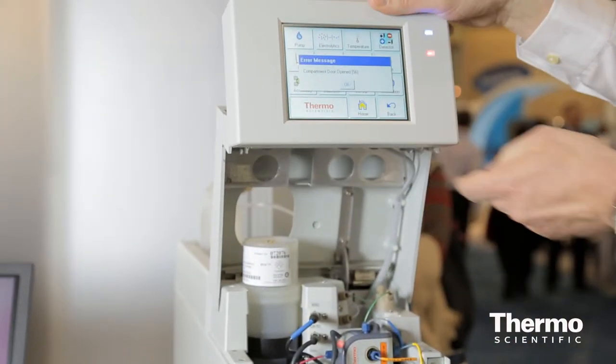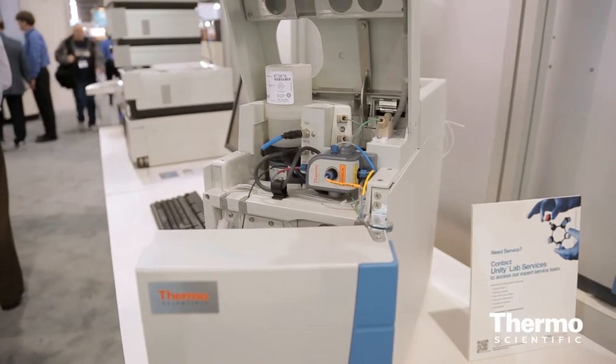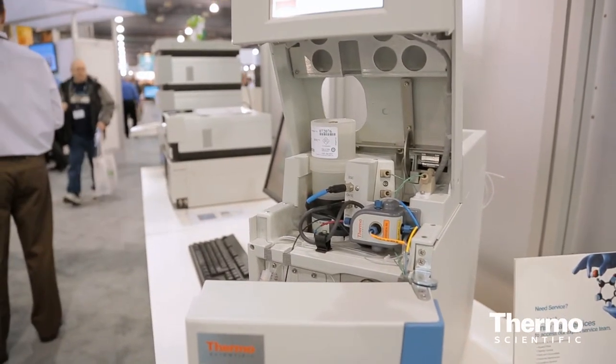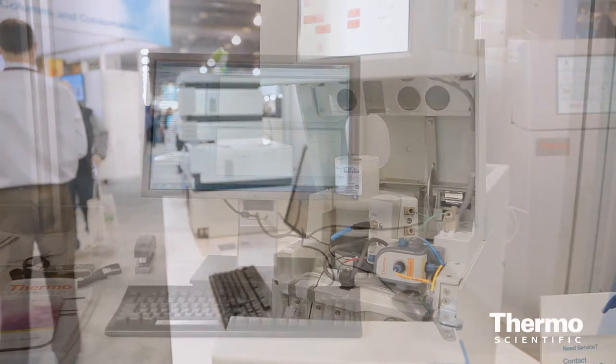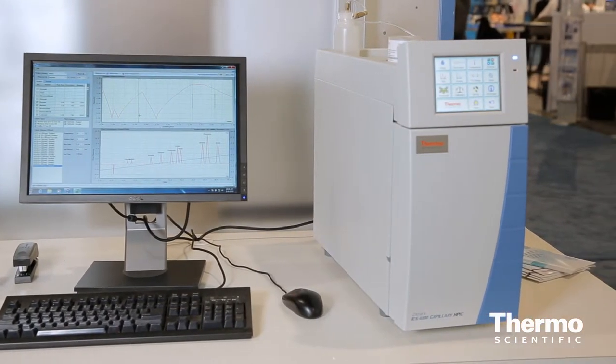The ICS 4000 has an optional electrochemical detector, also permitting HPAE-PAD analyses. The systems are completely bioinert — they're metal-free, made of PEEK — so they can withstand the high pH ranges required for the analysis. The ion exchange phases are also stable across a very broad pH range, from 0 to about pH 14.